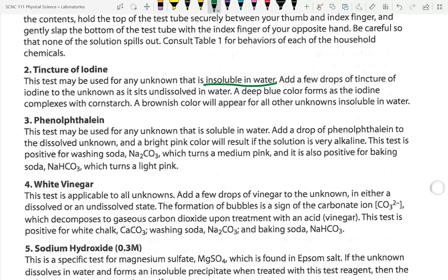You're not going to use the test tube again though, so just set the test tube aside and go on to the, actually now I think about that, we could use the same test tube for the same material if you're doing another test on the same material, which of course at this point I would be because I have one more test I would need to differentiate it. But don't use the same test tube when you go from sample A or sample 1 to sample 2, because you don't want to have any kind of cross-contamination there.